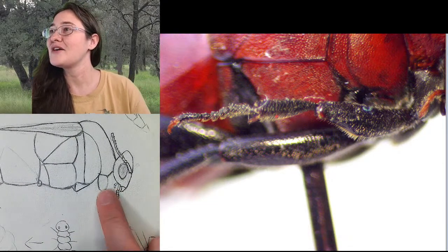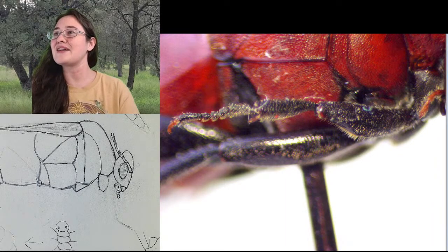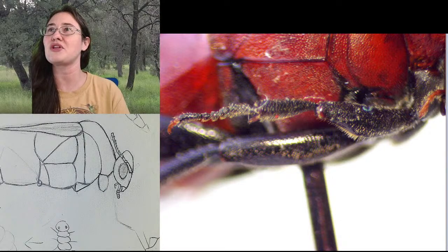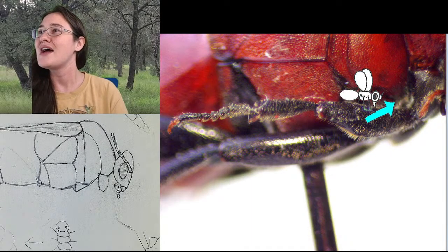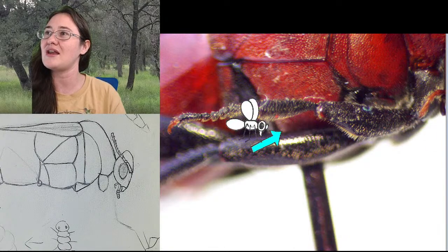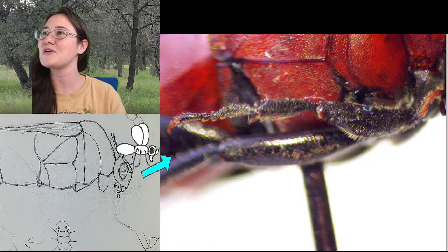Okay. So we are looking at and focused on this front leg, and I was able to manipulate the angle that we were looking at so that we could see the entire leg in one focus. It is kind of pointing backwards, so I'm going to be sketching it in another angle, I hope. But this is what he looks like so far.